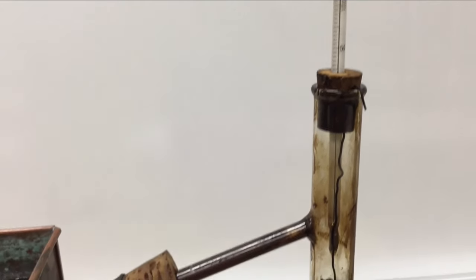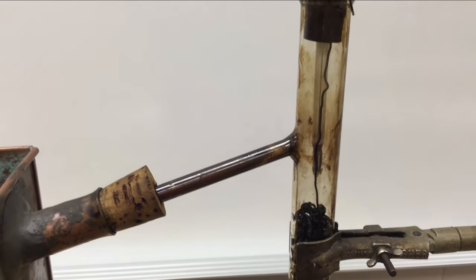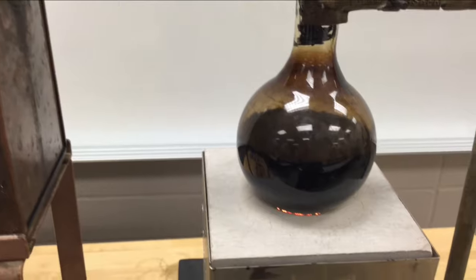Okay, so it looks like we're at around 580 or so degrees Fahrenheit. So we've been boiling this oil for about 1 hour. That's about what we do in the classroom as far as the amount of time that we have. One more time, we'll take a look at it, and you can see that there's condensation going on inside the tube. And that oil is extremely hot.